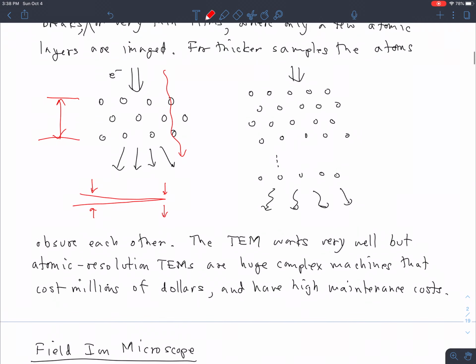A typical TEM sample, in fact, is a very thin film of carbon atoms with something deposited on the carbon atoms, and then you shine electrons through that. So basically the sample itself is suspended on a very, very thin film, a few atoms thick, and that's how you are able to see things. The other drawback to the TEM is that it is a huge multi-million-dollar instrument with an ultra-high vacuum, or at least a very high vacuum, set up in the middle of it.